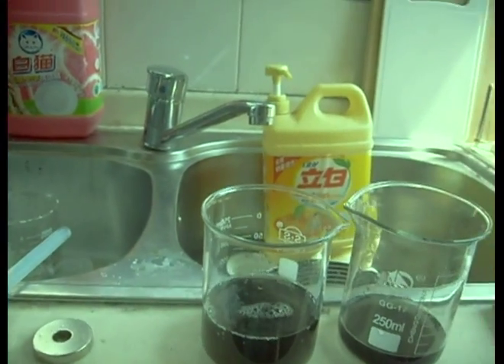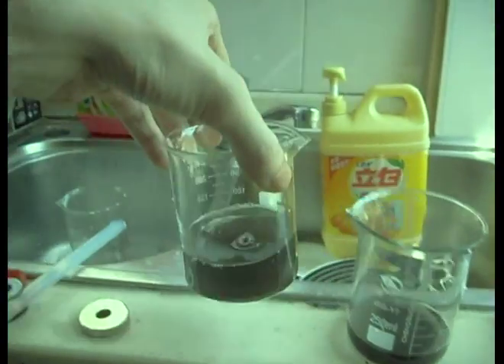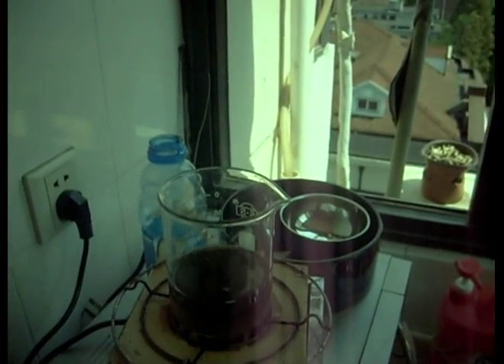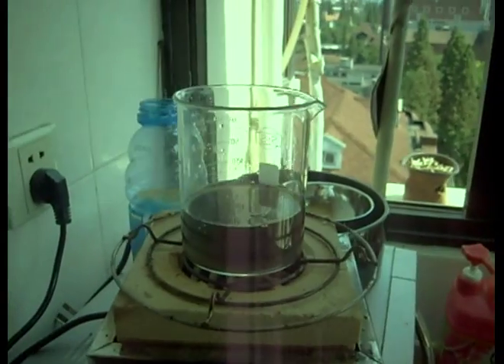Now, vinegar crystallizes, but it also burns to the best of my knowledge. So we'll see what we get, and we'll let that boil down.